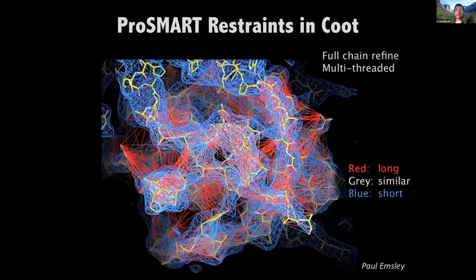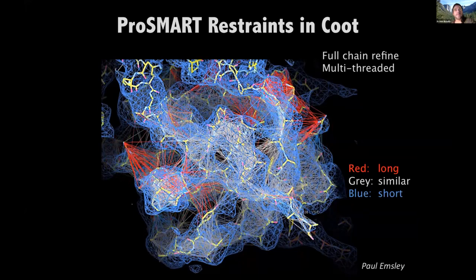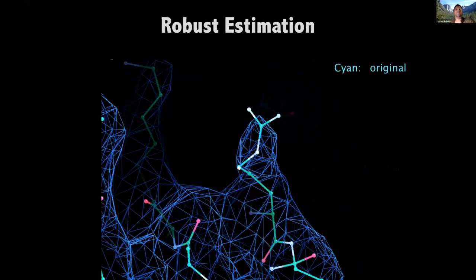Coot displays external restraints on a red-to-grey-to-blue scale, where red or blue means they are inconsistent — either too long or too short relative to the reference high-resolution homologous structure. Ideally you want them to end up relatively grey after refinement. But there may still be some red restraints indicating inconsistency, and sometimes that's a good thing. You don't want to force the structure to become too strongly like the high-resolution homologue if there is actually a true difference between that structure and the one you're trying to refine.